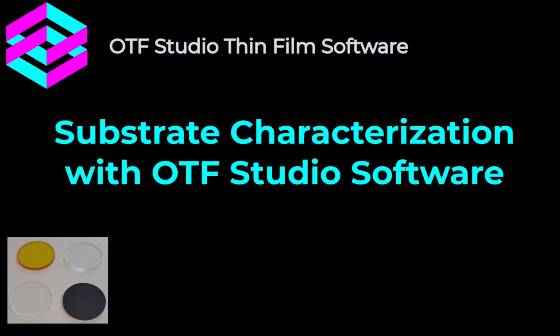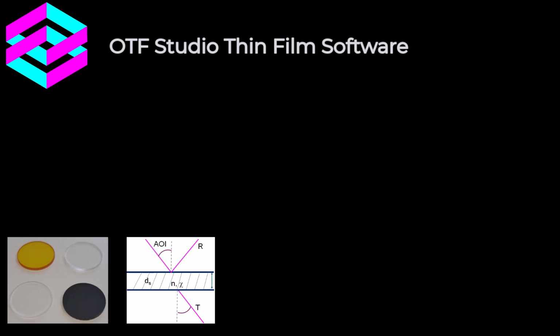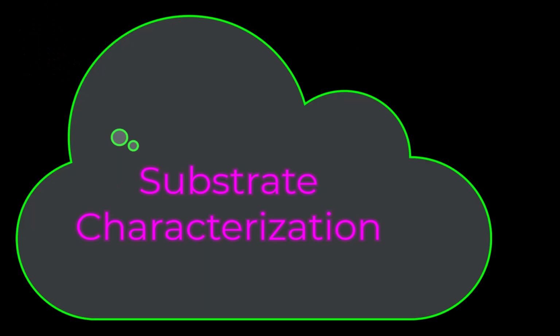Precise knowledge of substrate optical properties is essential for the theoretical design and monitoring of optical coatings, as well as for layer characterization and reverse engineering of produced coatings. For broadband design and production, it's important to know accurate substrate data across the entire spectral range. In this video, I demonstrate a reliable method for estimating optical constants of substrates using OTF Studio software.